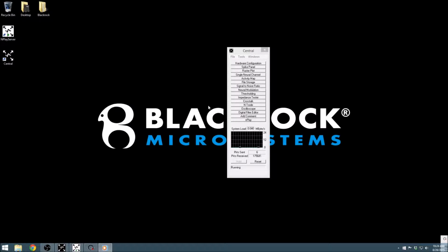This video series covers the basics of working with our Central software suite. If you don't have Central up and running yet, you may want to check out our Getting Started video for more information. This tutorial will cover two modules, Single Neural Channel and Spike Panel.